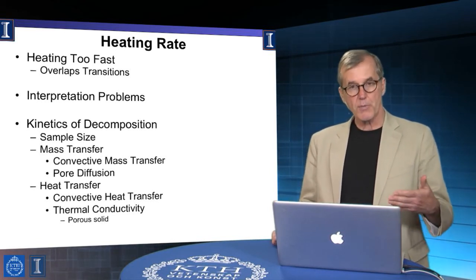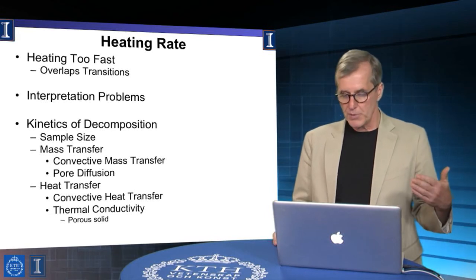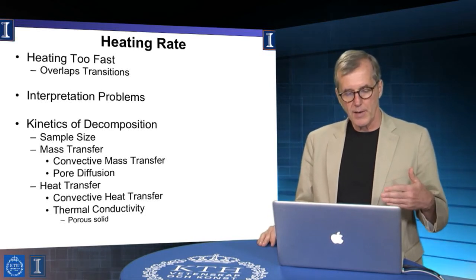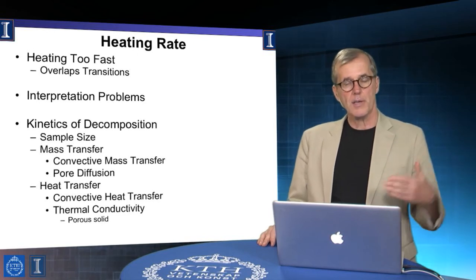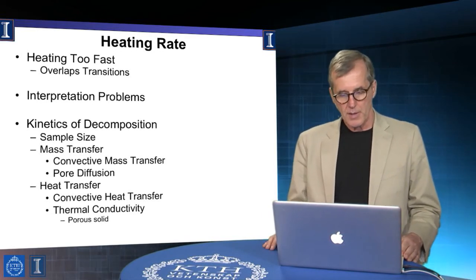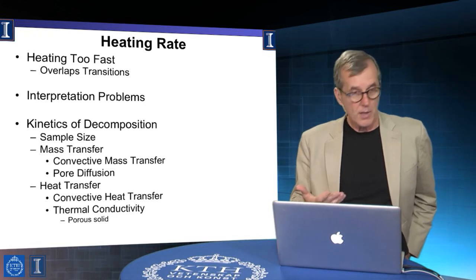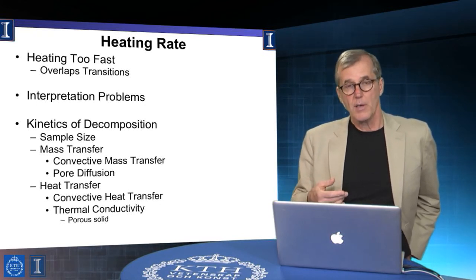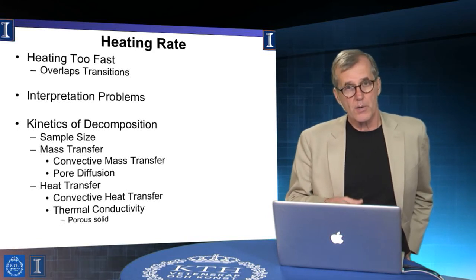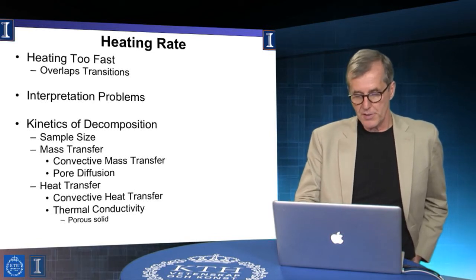The kinetics of decomposition, right? The sample size matters. You have to worry about mass transfer characteristics. So the samples can't be too small because then they're too small to measure. But if they're too big, you have to be careful that the temperature ramp rate is not mitigating efficient heat flow, so that you're actually measuring a hysteretic property of the sample. And as I said, anything that impacts heat transfer would be deleterious. So, for example, if we have multi-phase components which might segregate during the course of analysis, or thwart reaching steady state in some way, that could complicate an analysis. All right.